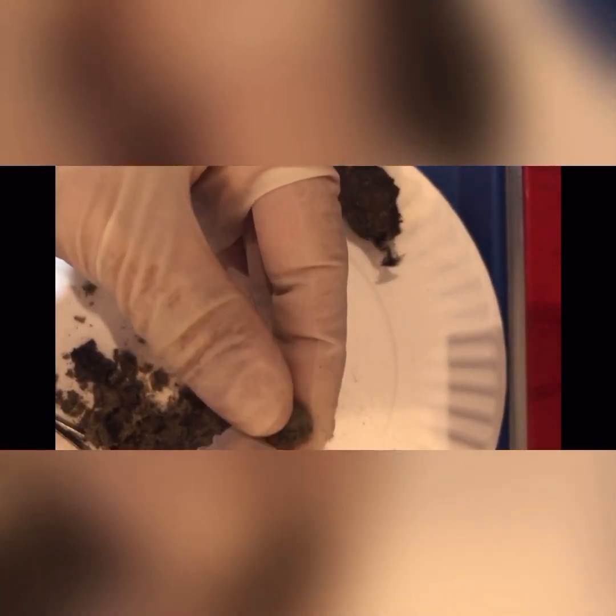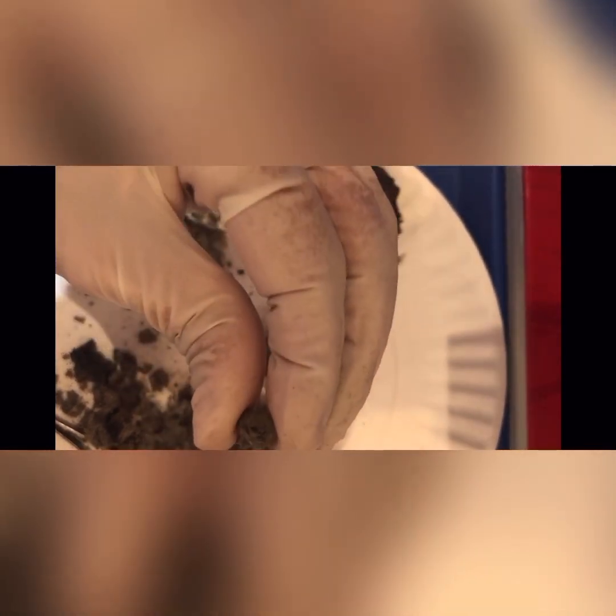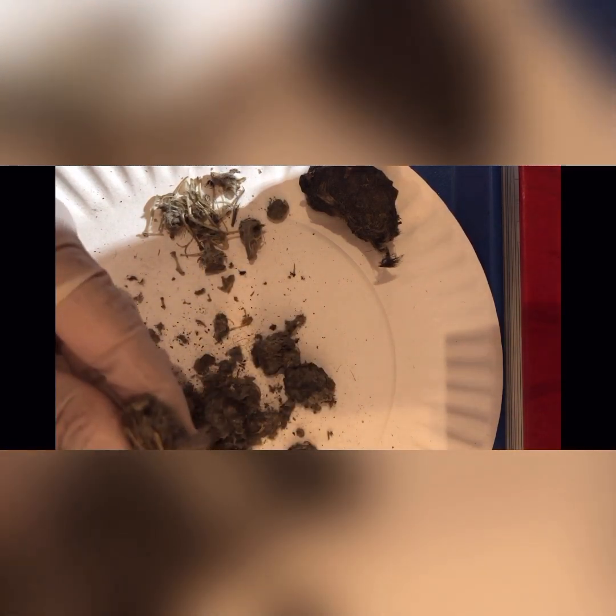Sometimes you might find broken pieces and you have to figure out later. So I don't know if this is part of a skull, but we'll figure it out. We'll see what we have and what we don't. And I am gonna just start picking out some of my bones in here. Oh, there's a whole bunch in here.